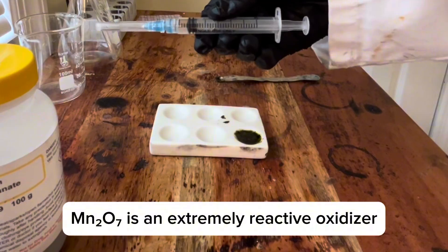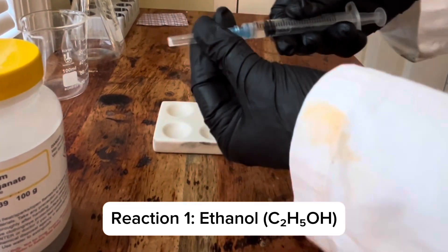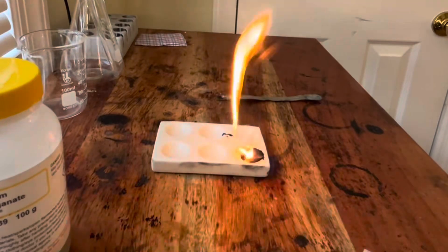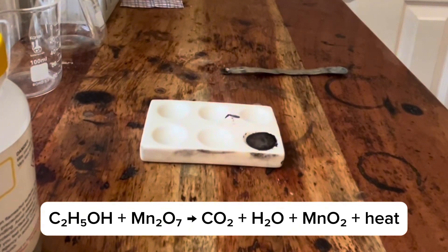Watch what happens when I add a tiny bit of ethanol. It's almost instant. Ethanol reacts fast due to its volatility.